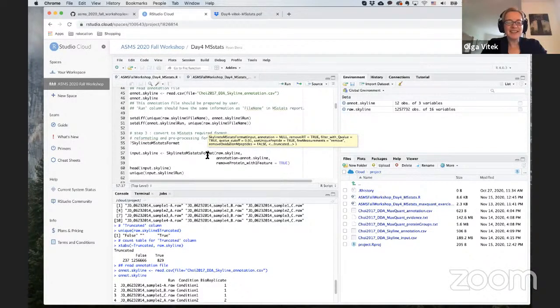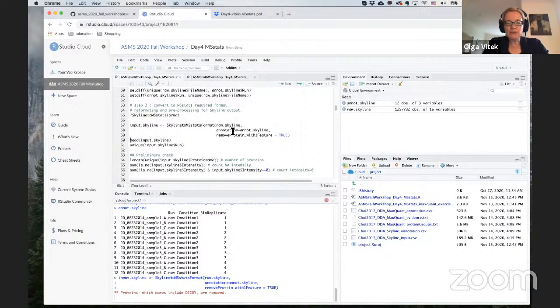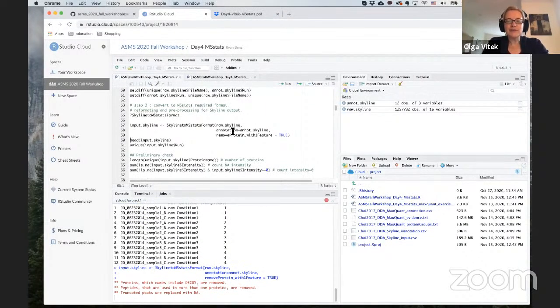Yeah, I can just add that a short answer is a few, but not too many. This is a very vague answer, but for example, in DIA you can quantify up to like 100 features per protein. Chances are you don't need that many. It will complicate your computation a lot, and probably some of them are closer to the noise level, and they will probably harm rather than help. So essentially, a few good quality features go a longer way than many noisy features.